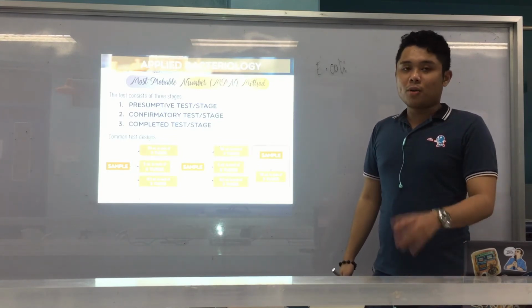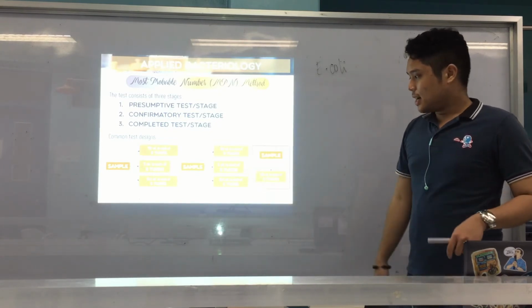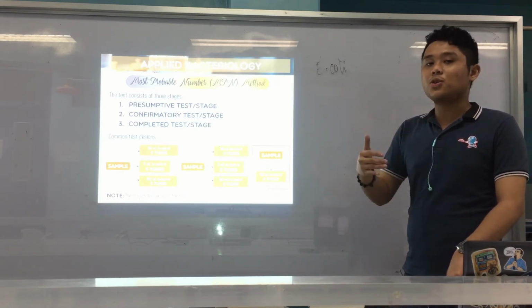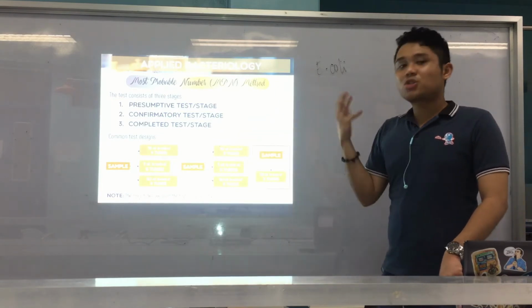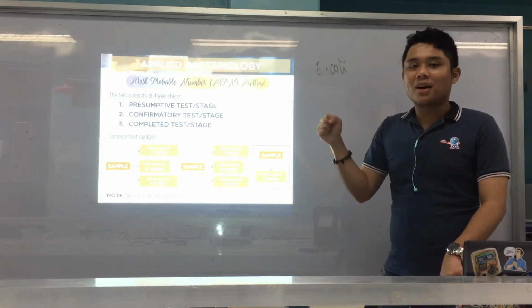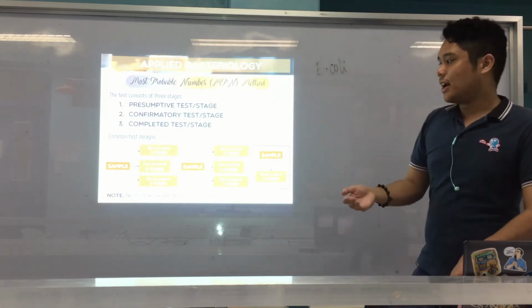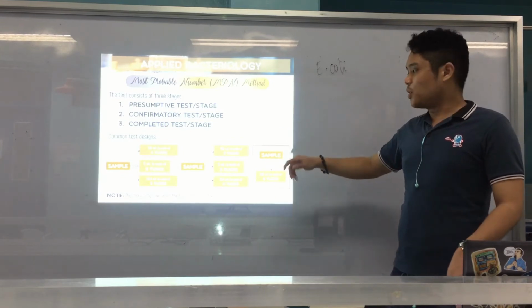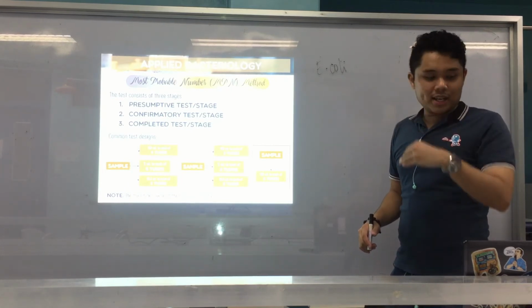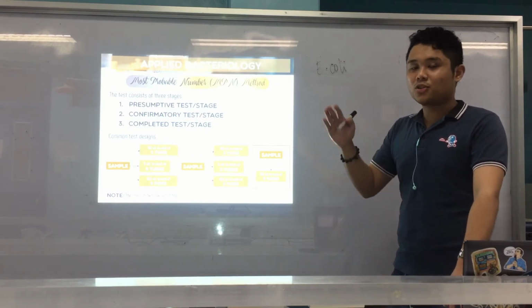But again, it is much more preferable to use a higher number of tubes to increase sensitivity. Of course, because you detect much more, since you distribute to a lot of tubes. It can include all the contaminants, especially if they are in low concentrations, so the sensitivity is higher. But in our lab class, what will follow is this: you take your water sample, get 10 ml each, and put it in 5 test tubes. So, 10 ml each to 5 test tubes.